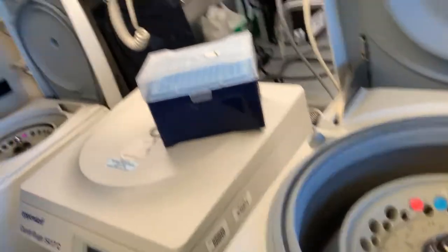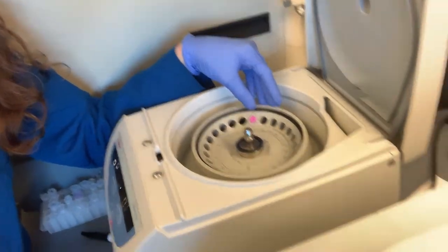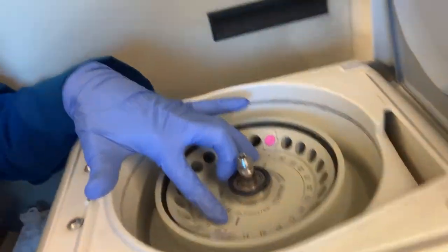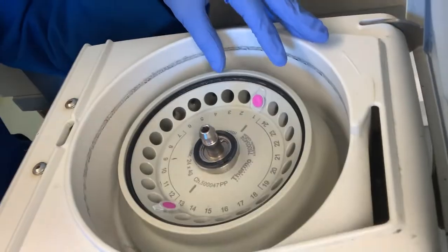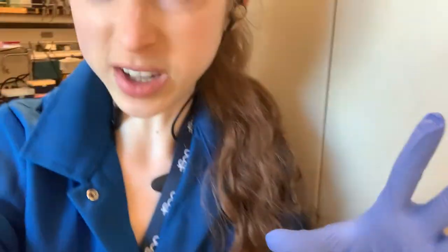First of all, you always want to make sure that your centrifuge is balanced, but it might not necessarily look balanced. The easiest case is if you have an even number of samples — you just stick them straight across from one another. Some centrifuges have a line across from the slots to help with this. You can also count the number of tubes in between to make sure they're directly across from one another.